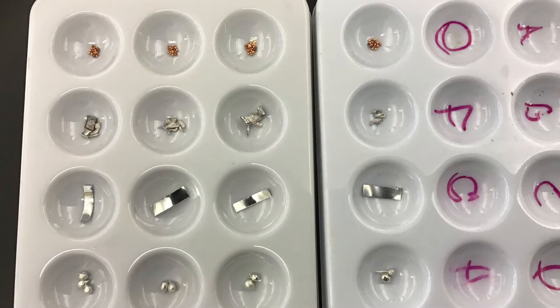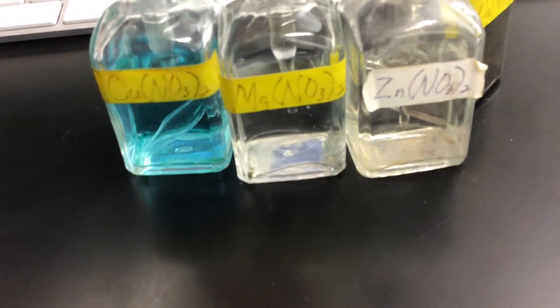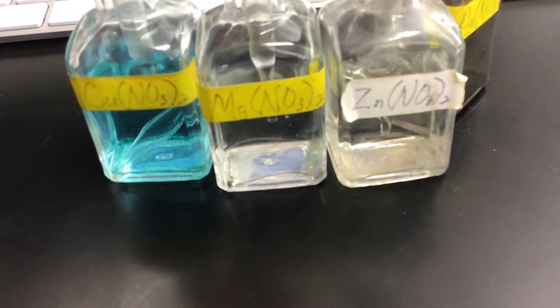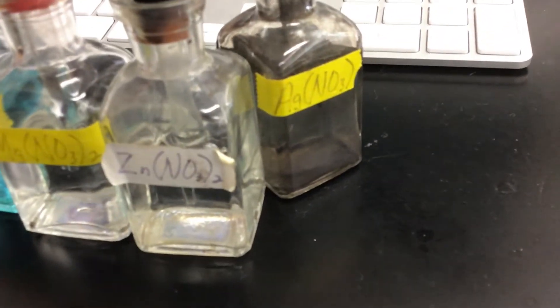Here are each of the metals in the well plates, copper all the way down to tin. Here are our compounds: copper nitrate, magnesium nitrate, zinc nitrate, and silver nitrate.